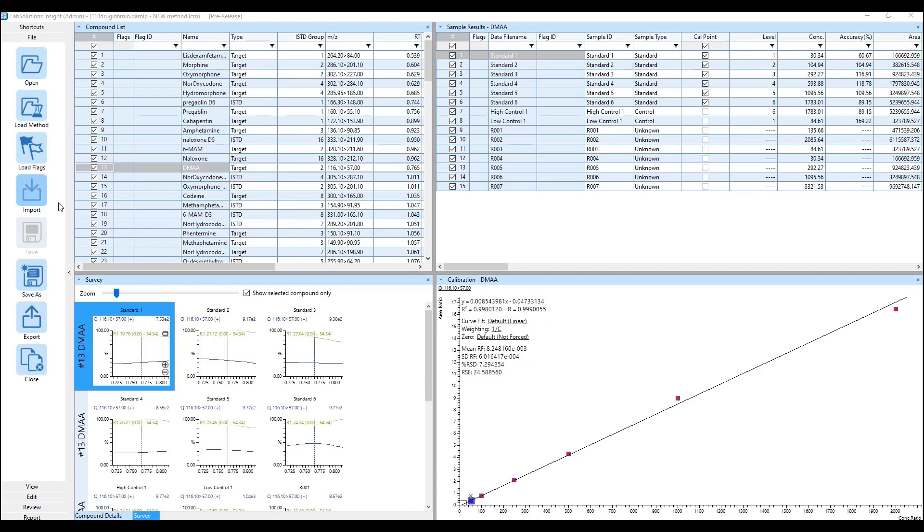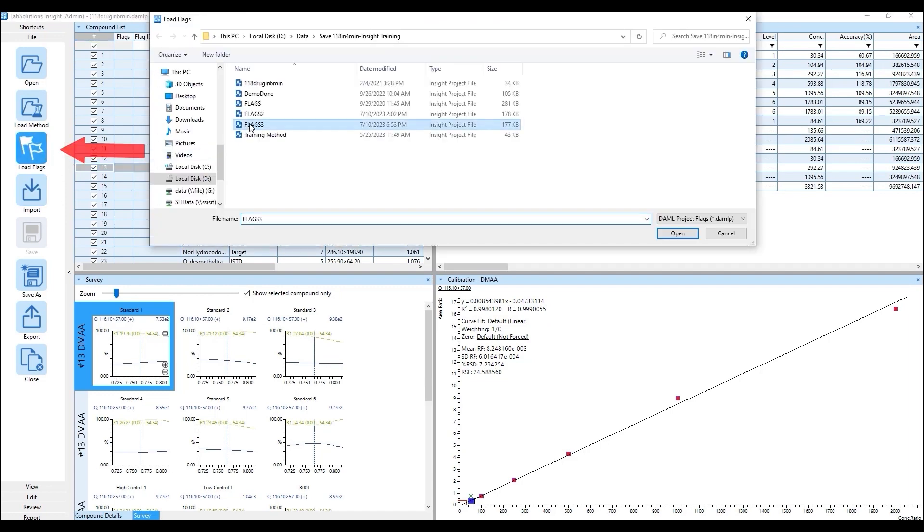If flags have already been set up for compounds, they can be loaded into the project using the load flags button under file.